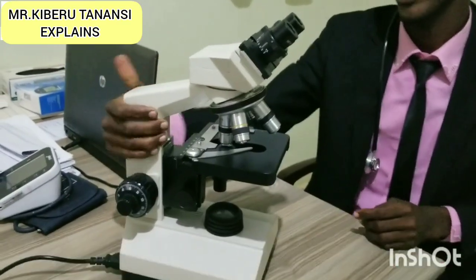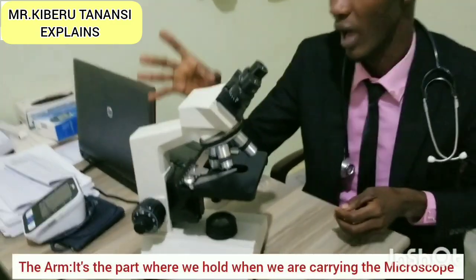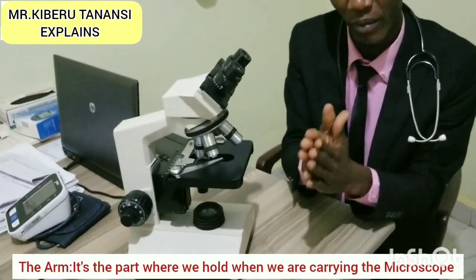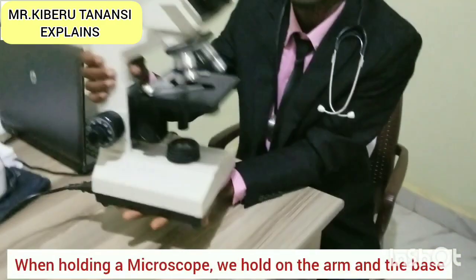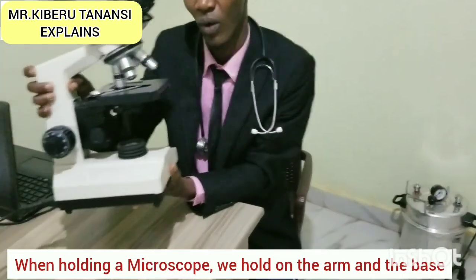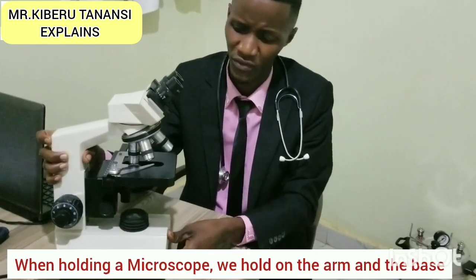Where I put this hand, the whole of this big thing behind here, is the arm. I call it the arm because it is where we hold the microscope. So when you are holding a microscope, my dear learners, you hold it on the arm and the base. One hand will be on the arm, another hand on the base, so that you avoid throwing the microscope down because it is expensive, please.